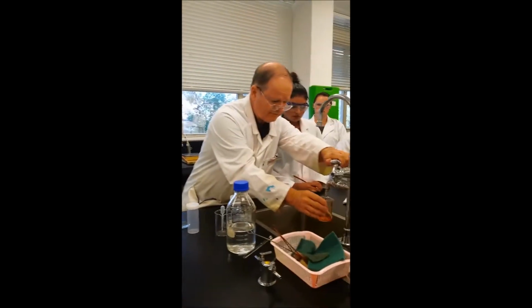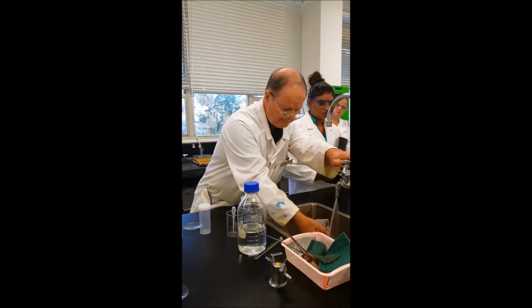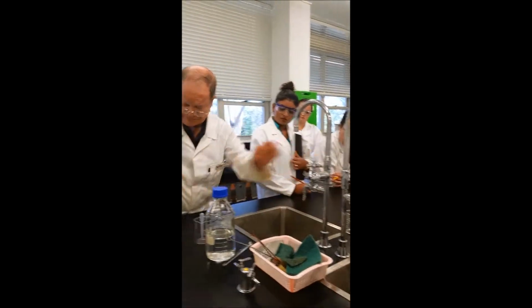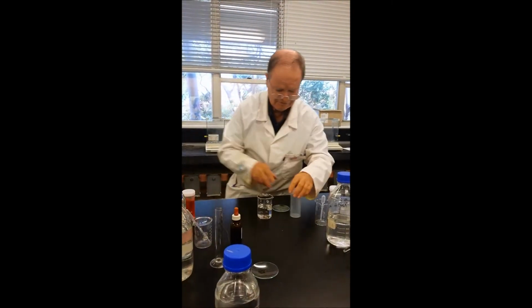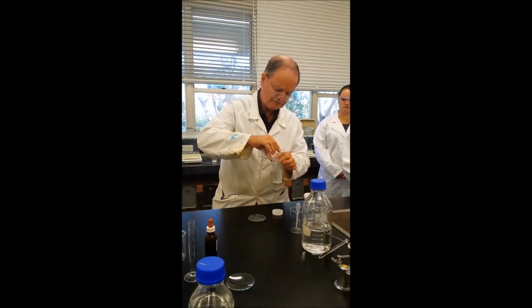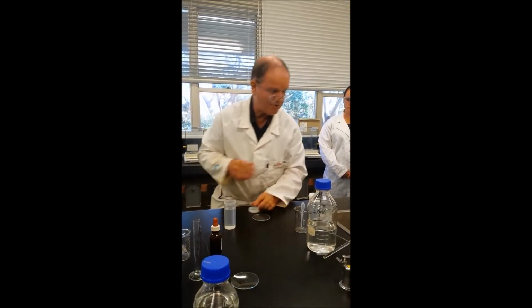And see there's a bit left, so we rinse out the beaker, and that should then go into the glassware for washing. Put the lid on that. Phenolphthalein. You can see it's not taking me very long to do it, but of course I've done all this sort of stuff before, so I've had a bit of practice.